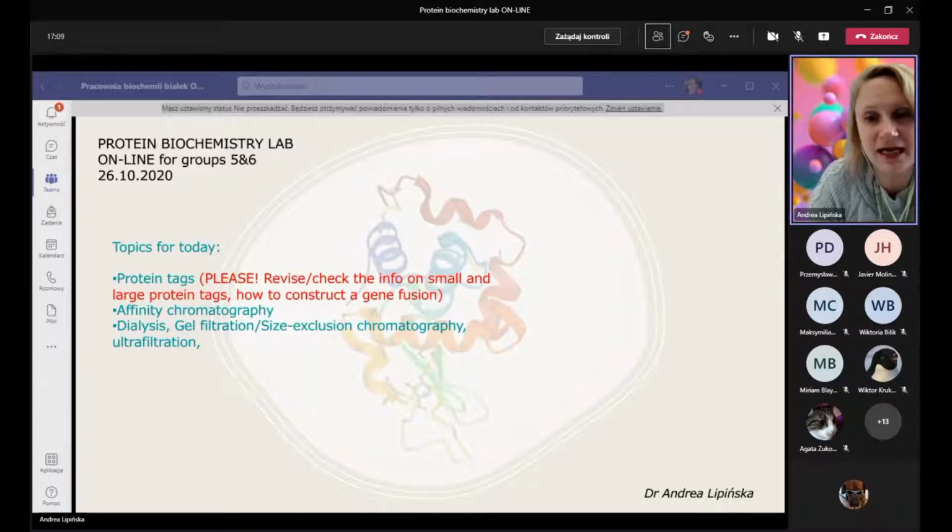Okay, but we have GST and the schematic representation of what's going on on our beads. So this week, what will be happening is here in this picture. We have CD81, which is our target protein, fused to GST, and you have a lysate. You know that there is some small amount of the protein in the soluble fraction, so in your lysate, and you will incubate it with glutathione affinity matrix, which is agarose. So this is GSH, glutathione agarose, which is used as beads. Reduced glutathione is a substrate for GST, so it will be bound to the enzyme, the substrate with the enzyme, and we will fish out our protein of interest, and of course interacting proteins, if there are any, unspecifically or specifically interacting.